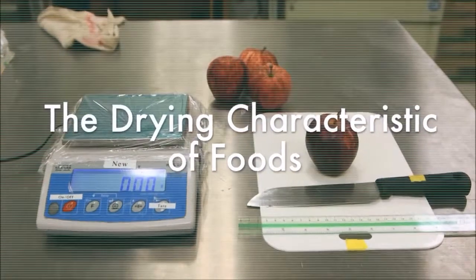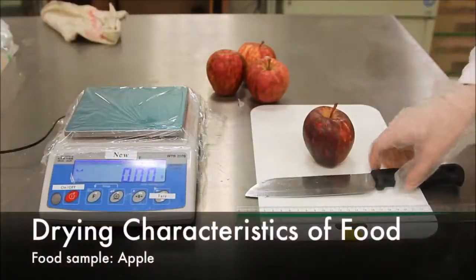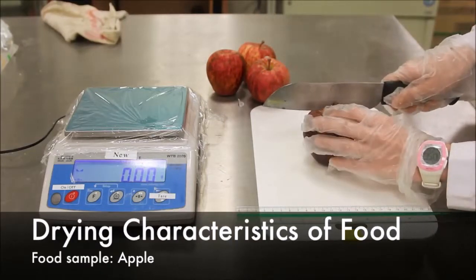The drying characteristic of fruits. The fruit sample used in this experiment is an apple.